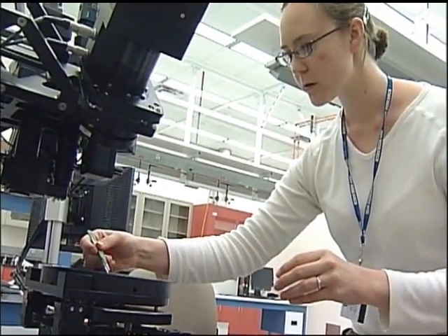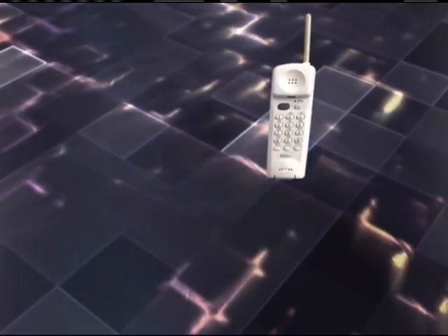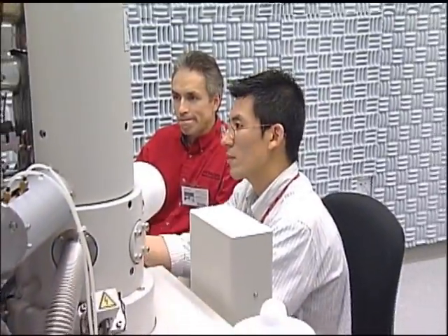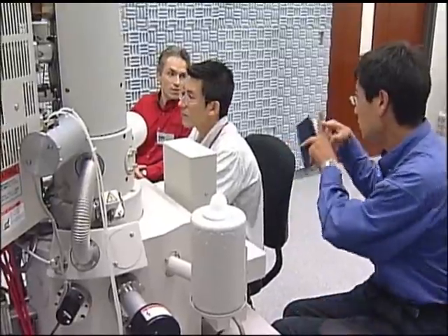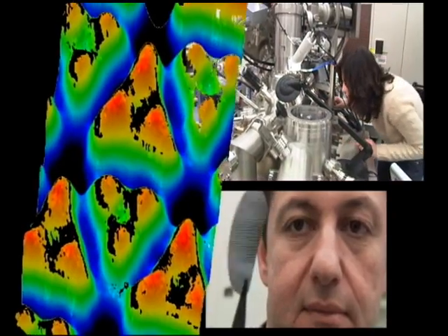Because materials structured on the nanoscale can have different chemical and physical properties than do conventional materials, the goal of nanoscience research is to develop new and improved materials, ones that are stronger, lighter, more reactive, or more energy efficient than present-day materials. Resident and guest scientists at the Center for Functional Nanomaterials are working in 3 research areas: nanocatalysts, biological and soft nanomaterials, and electronic nanomaterials. Using the CFN's many unique facilities, these world-class scientists are just beginning to explore the new and exciting world of nanoscience.